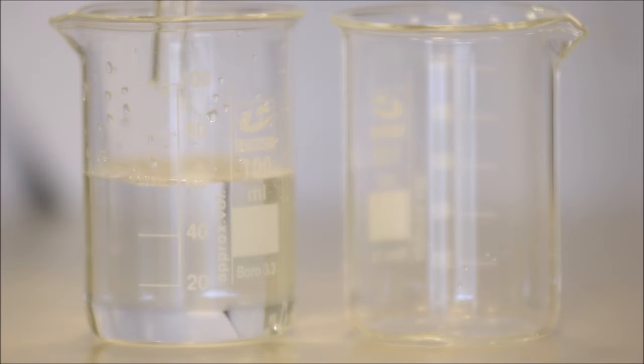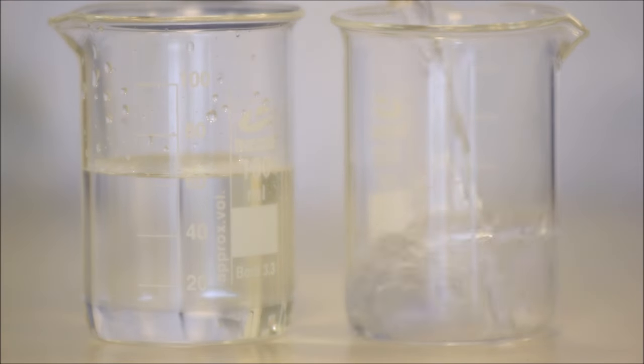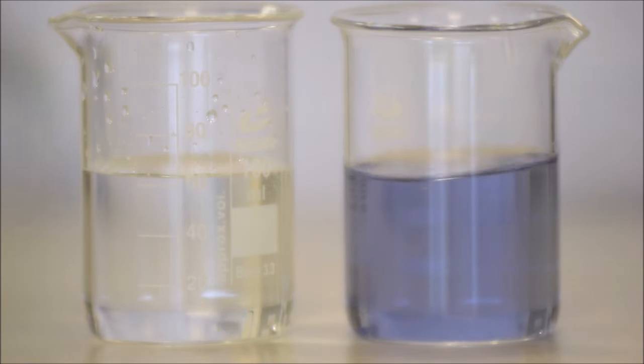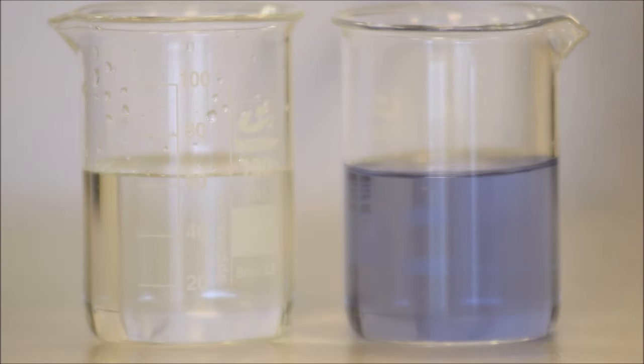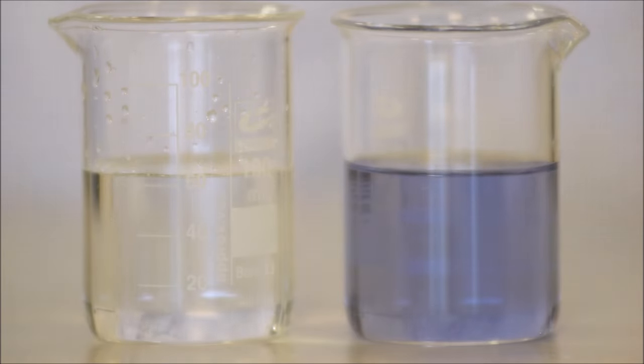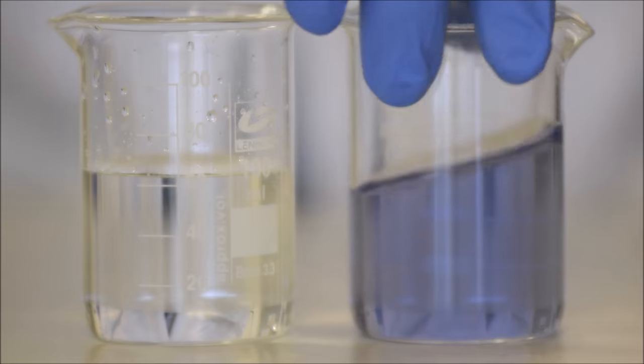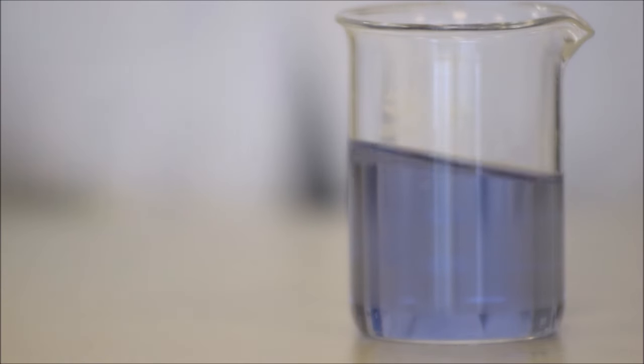And so we can use a drying agent like calcium chloride or magnesium sulfate. What that's going to do is, like those little silica beads that you see inside new electronics you buy, it's just going to mop up the water. So our organic layer is the purple layer. Let's get rid of the water layer for now.